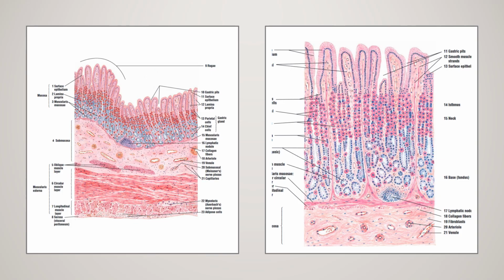So first we will see the slide of stomach fundus. First, what you have to note in this stomach is the presence of four layers. So this is your mucosa. This is your submucosa. Next you will be having your muscularis externa. Next, this is our serous covering.